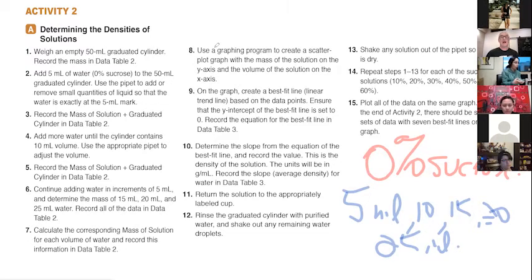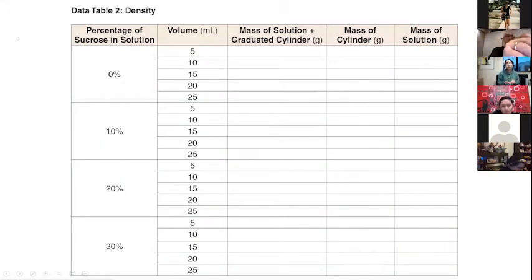And then we're going to plot them in order to determine what the density is. So I'll show you how that's going to work. For each one of our solutions, starting here with water.